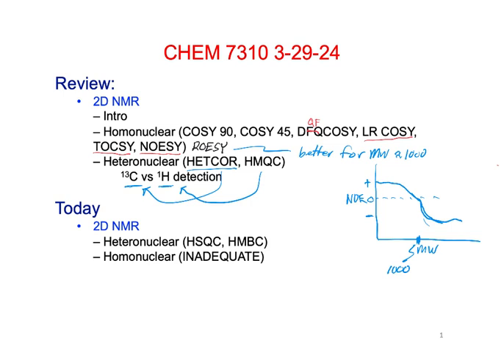Both of these are one bond carbon hydrogen coupling experiments, so they essentially tell us which protons are attached to which carbons.